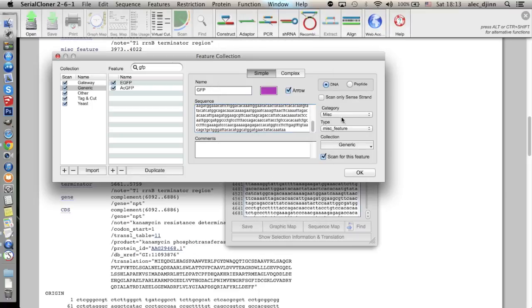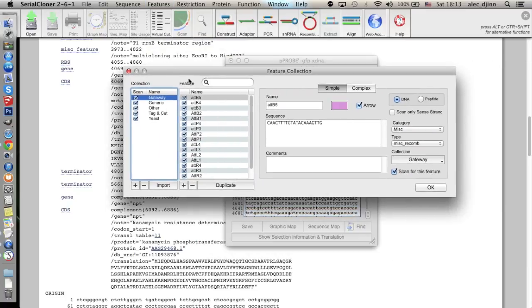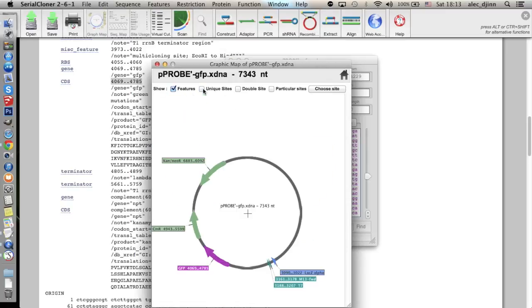We can input some more details on the sequence — for example, we can specify that it's a gene. If we check the feature database again, we can now see that our new entry is present. Let's scan the plasmid again. Here in purple is our GFP gene. Now let's have a look at the graphic map of our plasmid — and there is the GFP gene. The donor plasmid is ready. We can save it and go on with the next step.